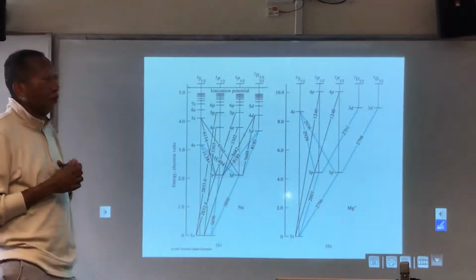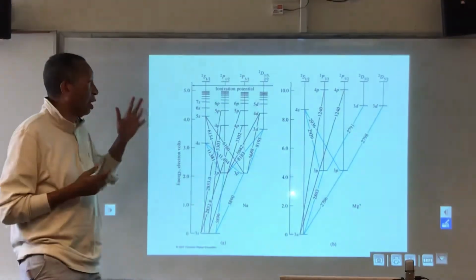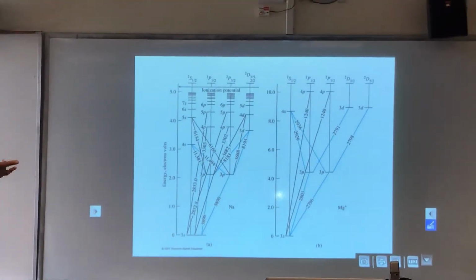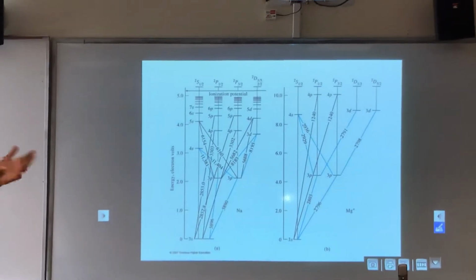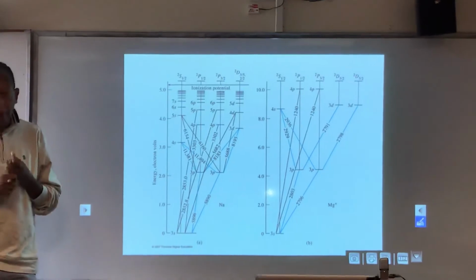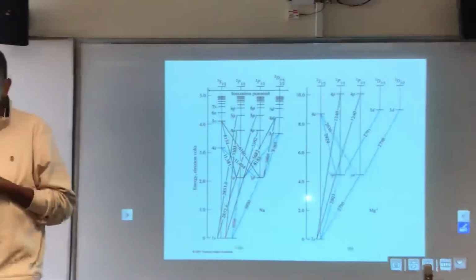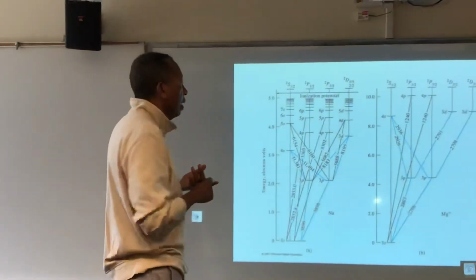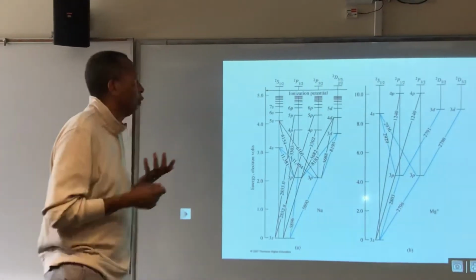Remember, the effective bandwidth is the bandwidth at half peak height, okay? So we had relatively large bandwidths, and that drove the type of instrumentation that we had. Remember, we had a broadband source, we had a wavelength selector, then we went to the sample, then we had the detector, and then we had electronics, right?